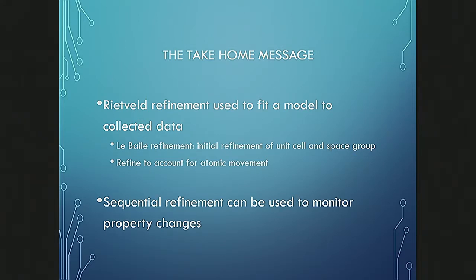And we were able to quantitatively determine how much of the phase was in the copper oxide phase and how much was in the copper metal phase. But one thing to keep note of when you do these Rietveld refinements, as Zach was just talking about, is to make sure that you don't overfit your data, because you can fit anything and you don't want to be led to the wrong conclusion.